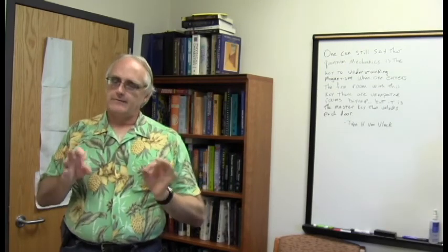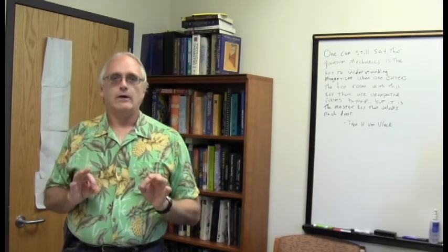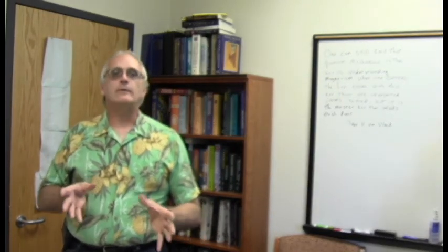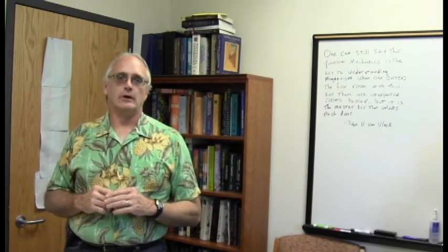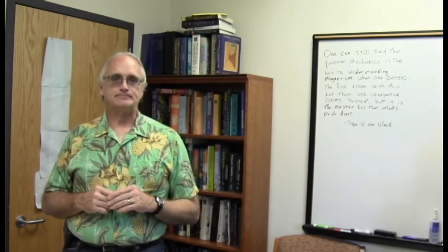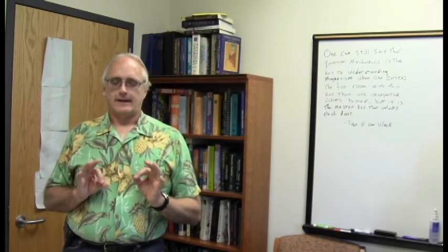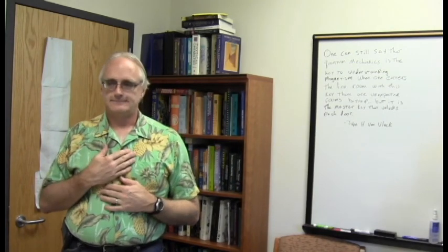Again, you never start the analysis with the 2Ds. Always start with what we know. The protons, number of groups, integrations, all that stuff. Work your way up. Build your clues. Build the fragments as you go along, much like we did here. Oh, what a lovely, lovely logic puzzle this stuff really is. Oh, just love it.